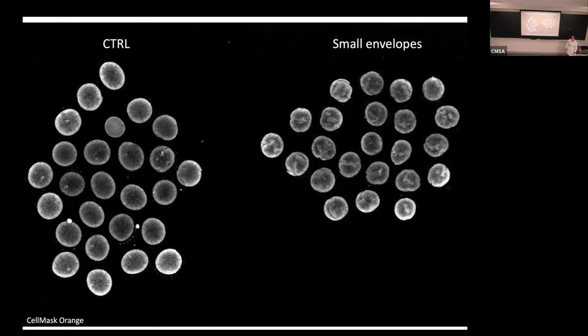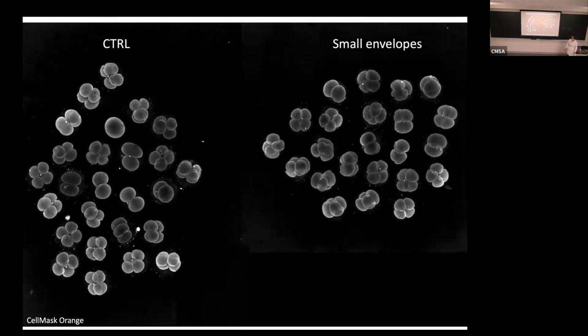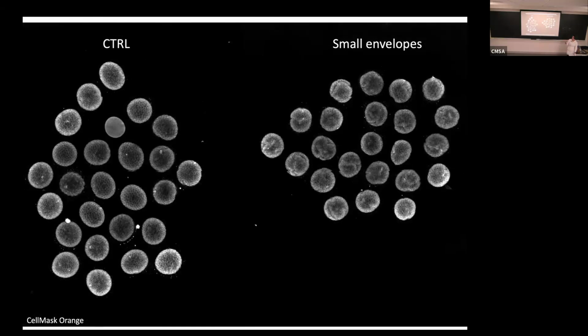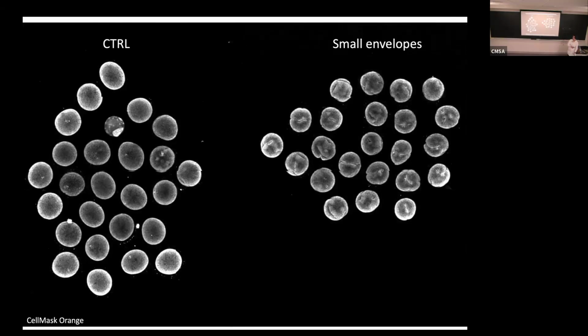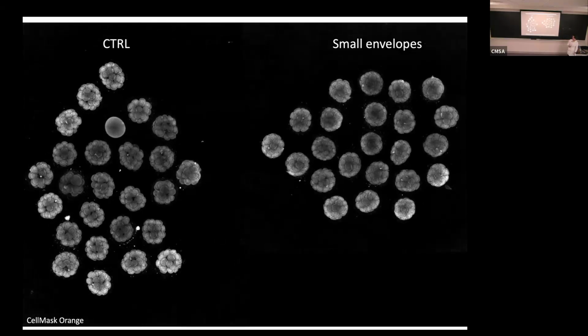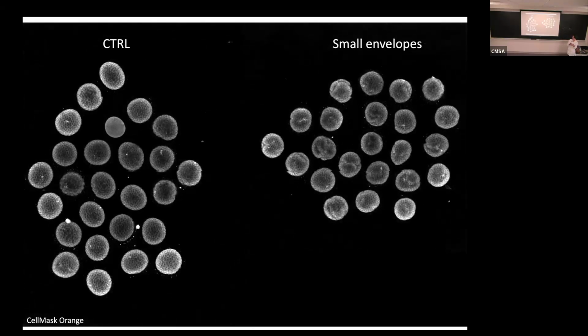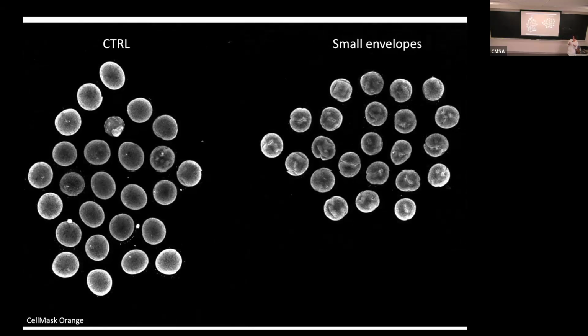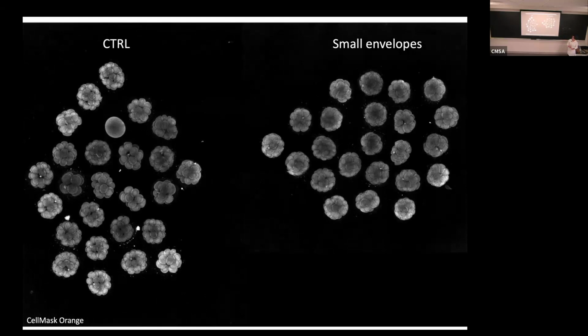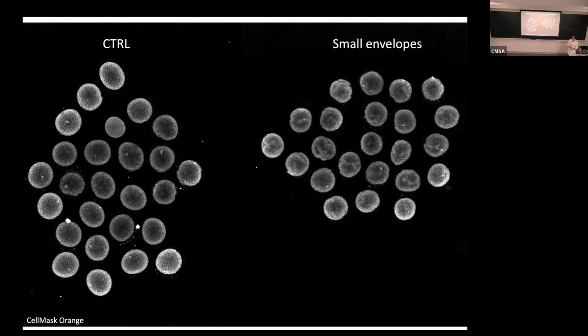Yeah. So a very standard approach to control this, and we were just talking about it, is to just add Ficoll. Yes, and the Ficoll doesn't get in, but it essentially dehydrates, so it compresses the envelope. So I was trying to find a way where I don't have to keep them in a weird medium, because we do this for 2 minutes at fertilization, then we put them back in normal seawater, and it stays, right? So I think the ion concentration is actually changing the enzymatic reactions that happen at fertilization. There is an ovoperoxidase that cross-links proteins, and there are proteases that do another job. That said, Ficoll on the outside of the vitelline membrane is probably quite harmless. Possible. We could try that too.